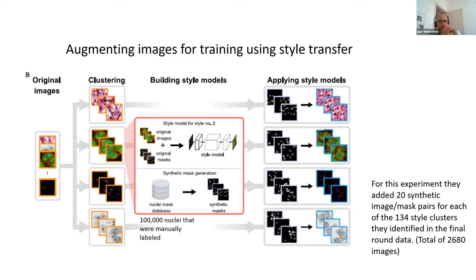Other questions? So I think the field is going, and we are going to see that also in the other papers, into generalizing, right? Using as much data, as much diversity in data as possible. In this case, the idea is nucleus detection, nucleus segmentation, which is a common task, but then you have all these different imaging techniques and labels, which show completely different images, but still eventually the task is the same task. And the network apparently is becoming better when you feed it with diverse data.